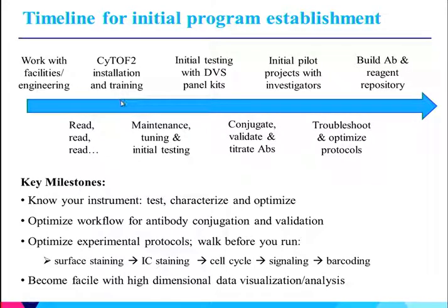A consistent theme that I found, talking with Aaron and many other people, is that the CyTOF arrives and all of a sudden you realize there's 3 things wrong with the room that prevent you from being able to install it. So that can be nipped in the bud by, again, having a clear working relationship with engineering beforehand. There is a ton to learn about the CyTOF. It's an interesting instrument, and it's really at the interface of all sorts of technologies. So before it gets here, the person responsible for it has a lot to read.